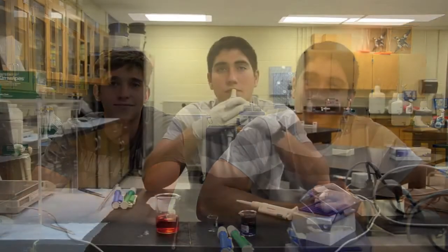Now, there are a range of pipettes, going from the micropipettes, which can go from 1 to 10 microliters all the way up to 1,000 microliters, which is of course 1 milliliter. And then Stephen's going to tell you about the larger pipettes, which can do increments of 1 milliliter all the way to 10 milliliters. First I'm going to show you how to use a micropipette.